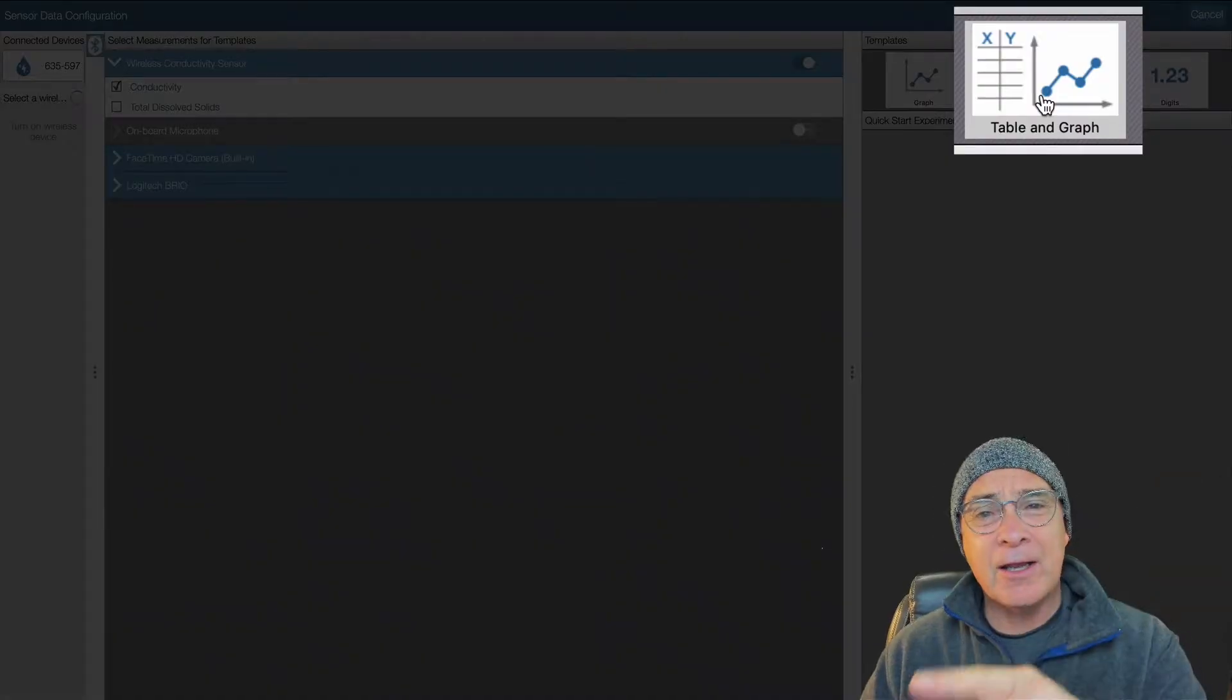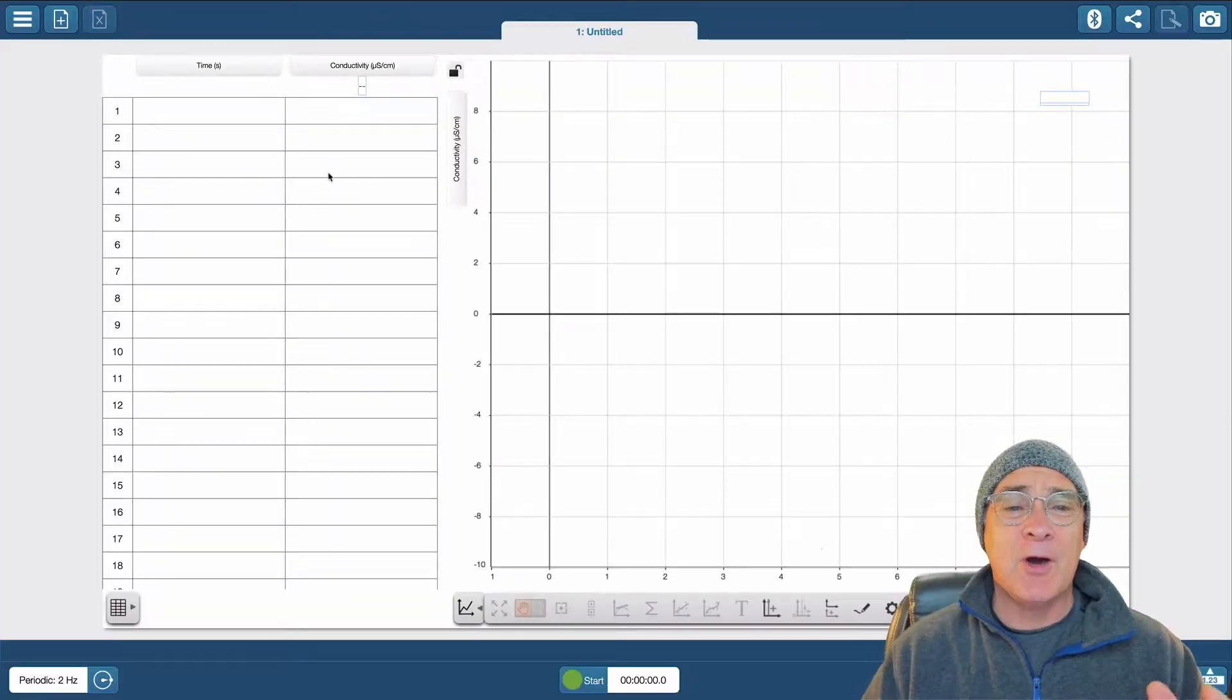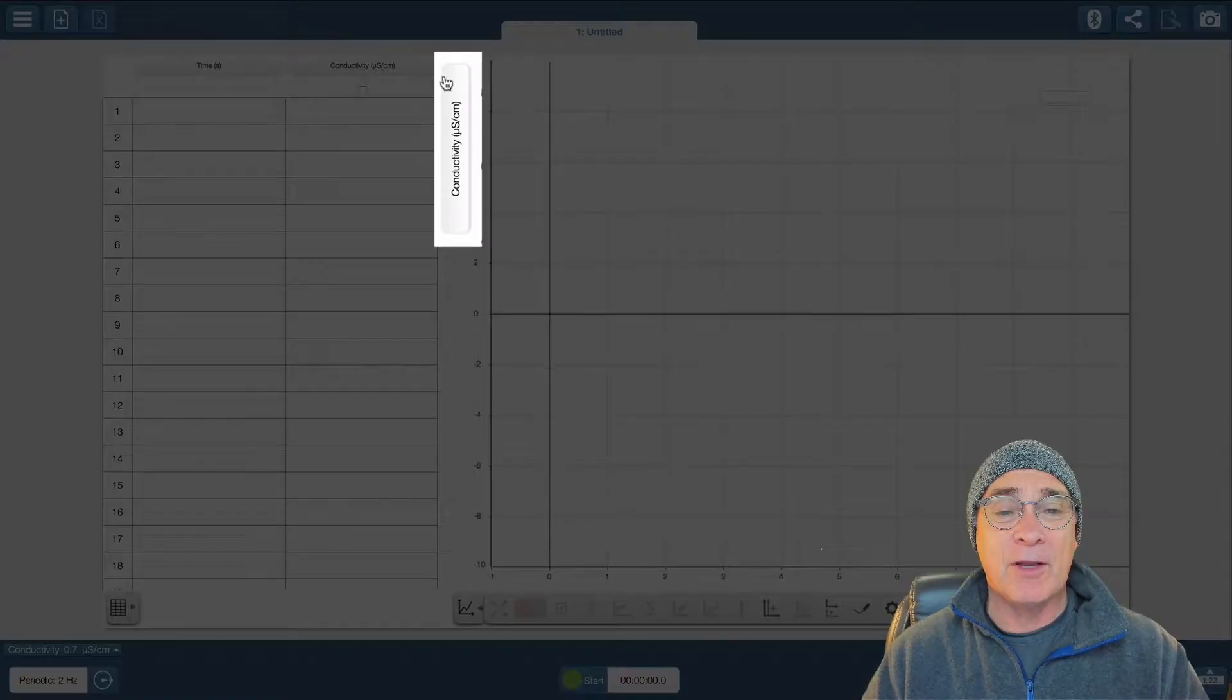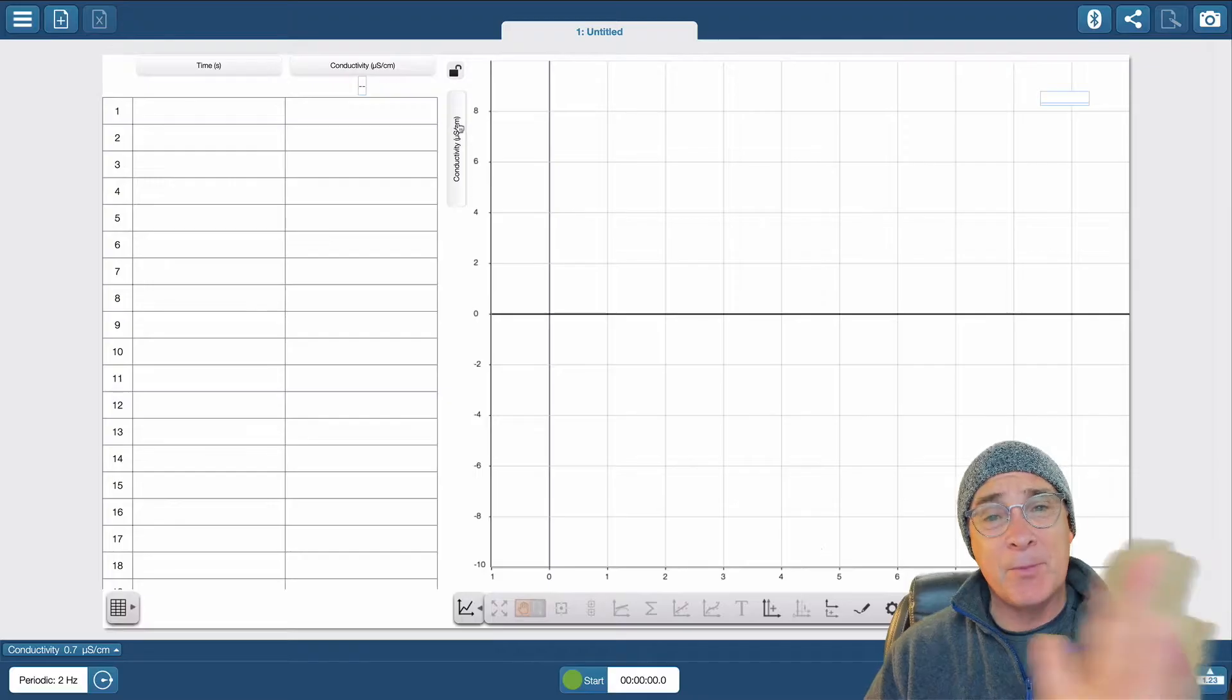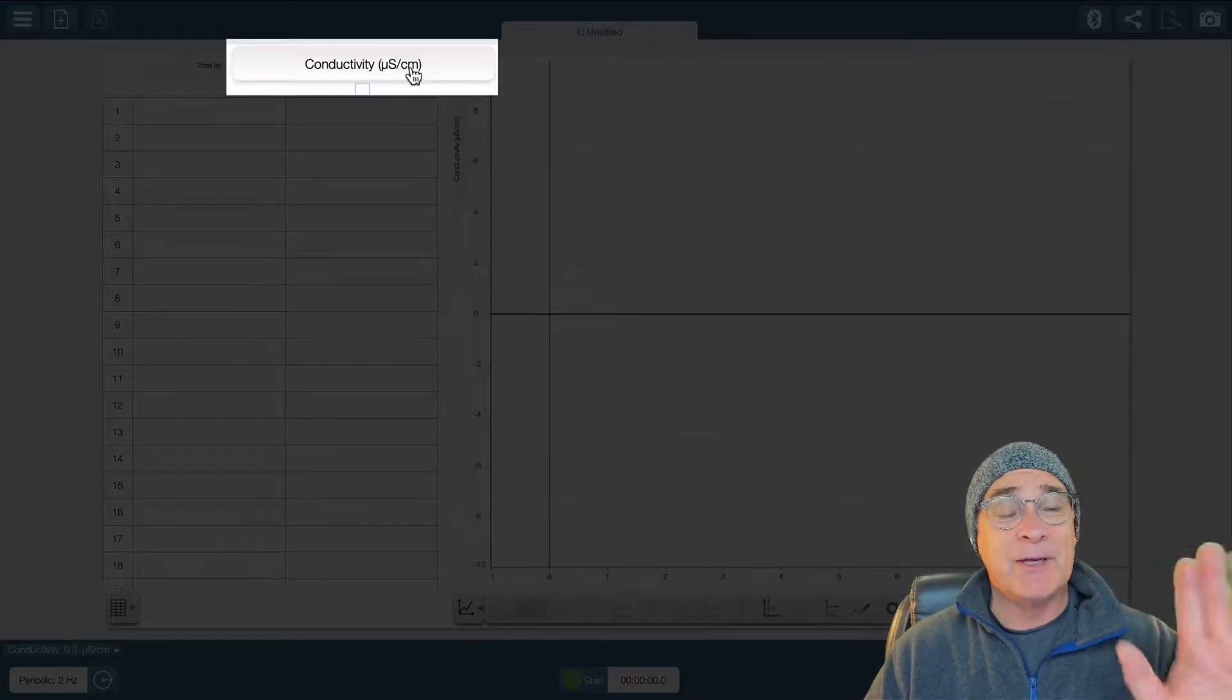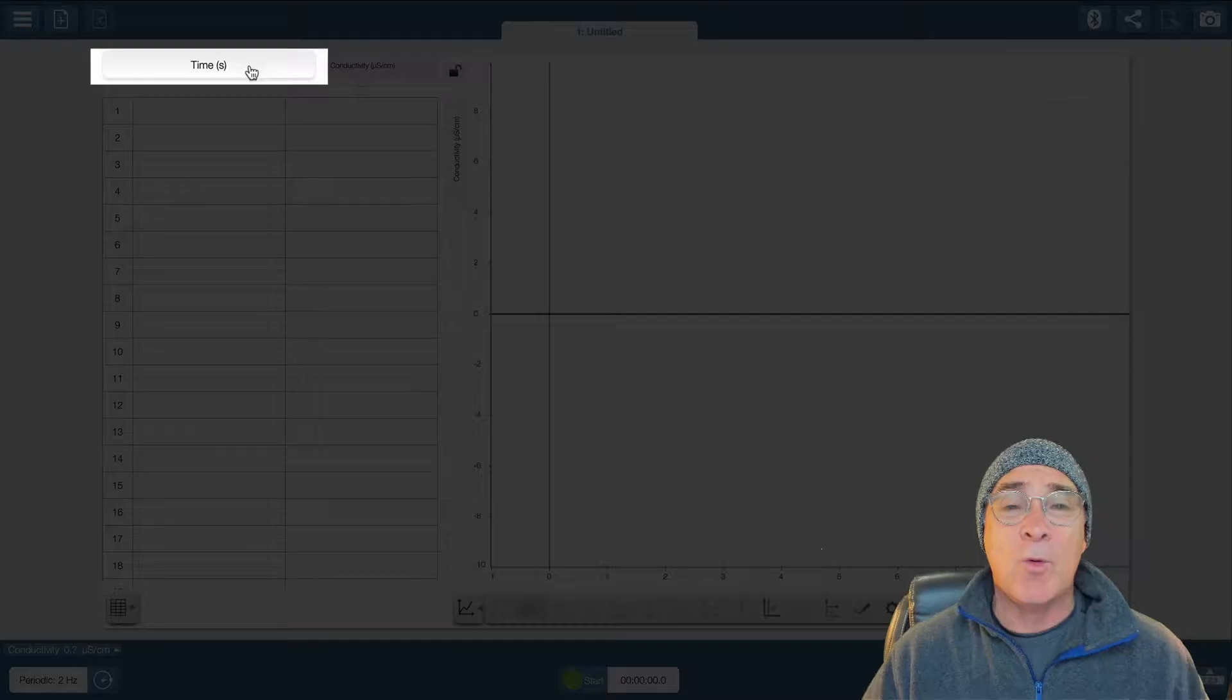You're going to click on that middle square because that's what we want, the table and the graph. But you'll notice this graph already has, with the graph right here on the y-axis, it already has this label. It just picked it up and put it over when we paired it. Same with this table, but it only did one side. This other side is time.